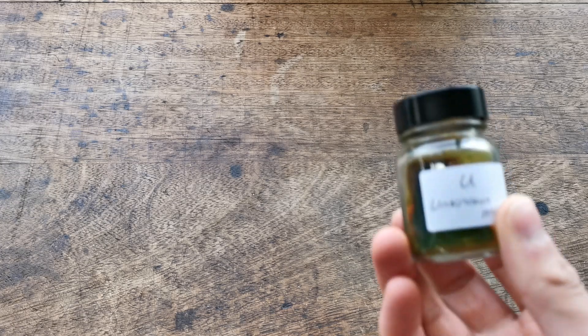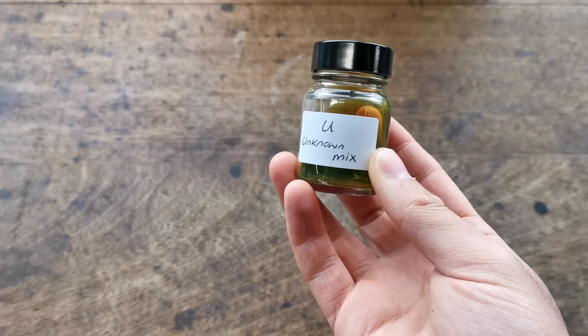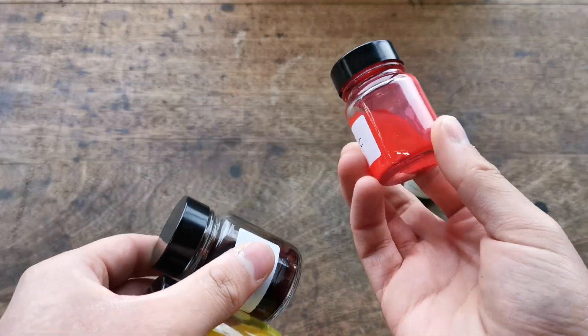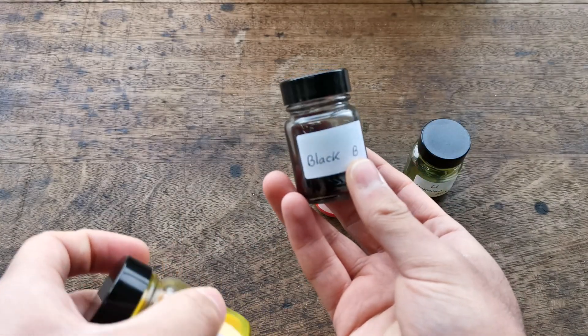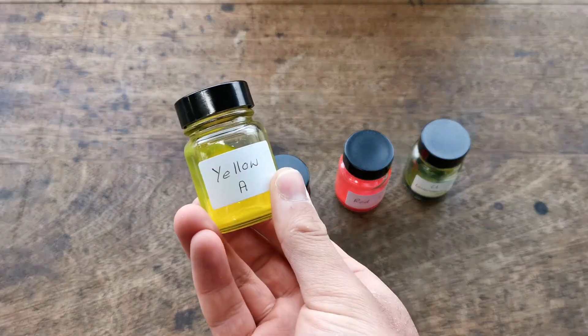Today we're going to be carrying out the chromatography of this unknown mixture of colourful dyes. Two or more of these known coloured dyes are mixed together into the unknown mixture and we're going to separate them.